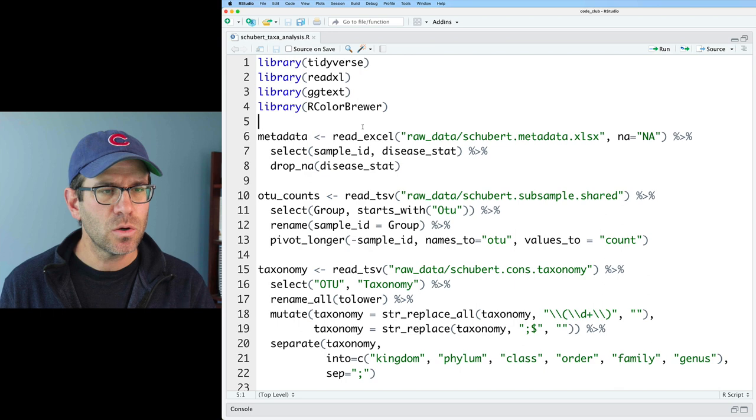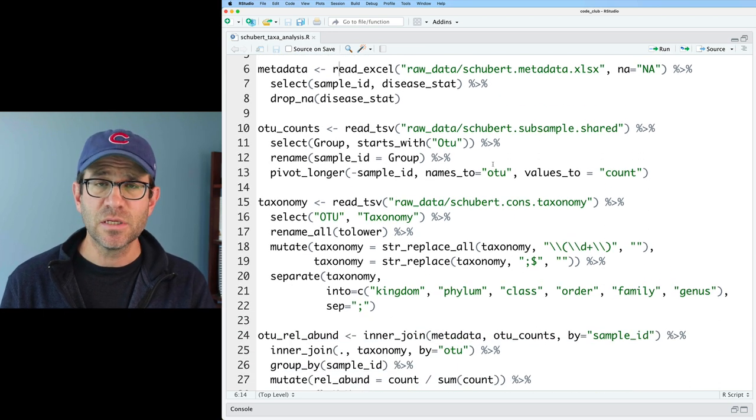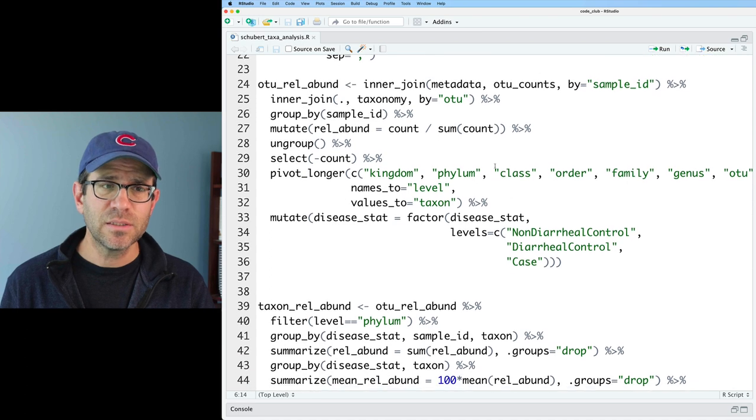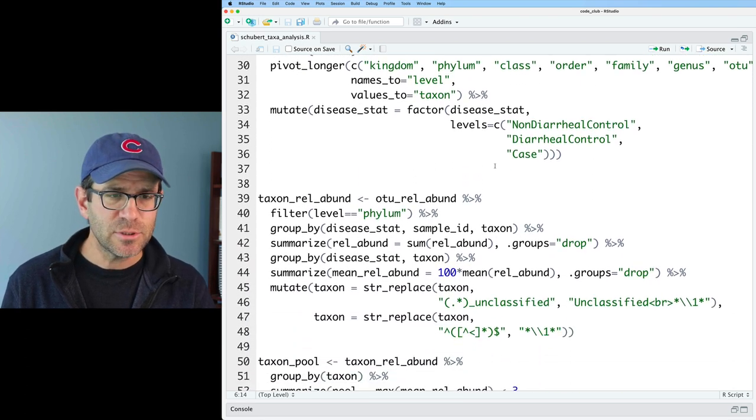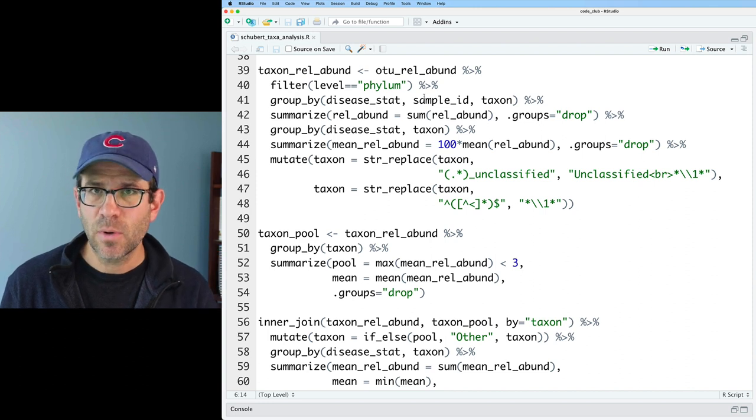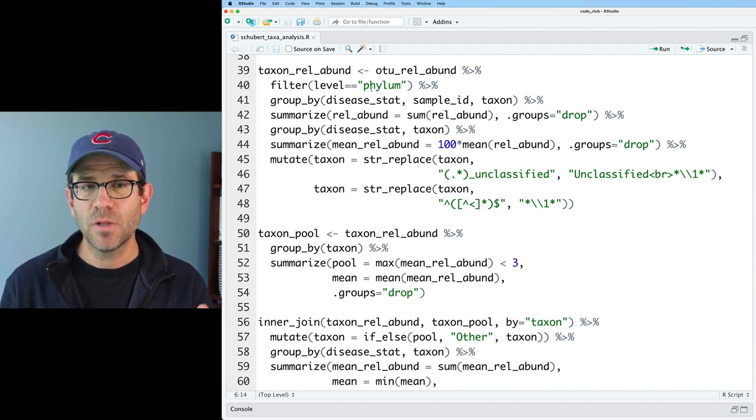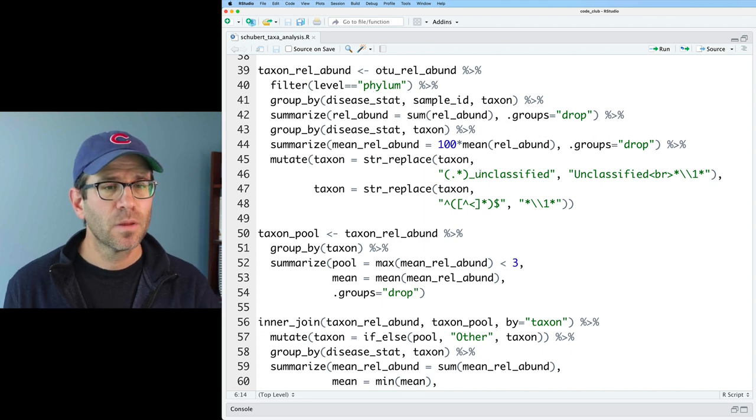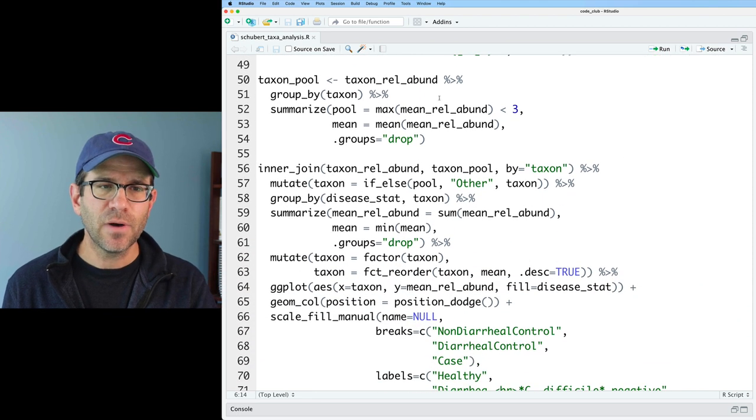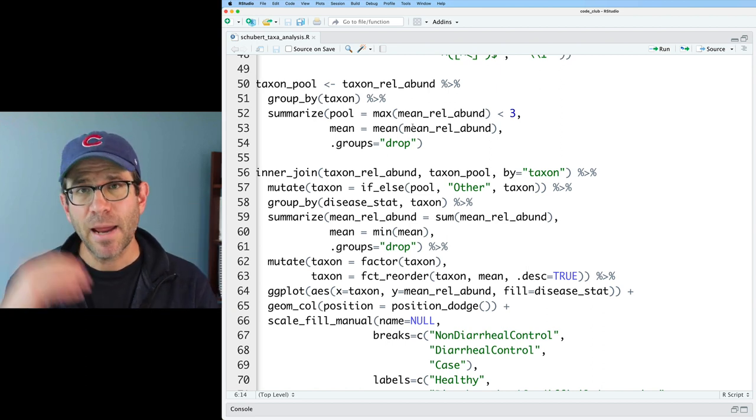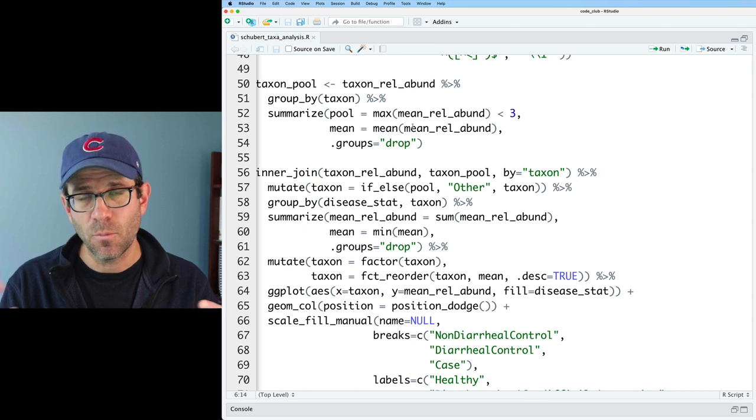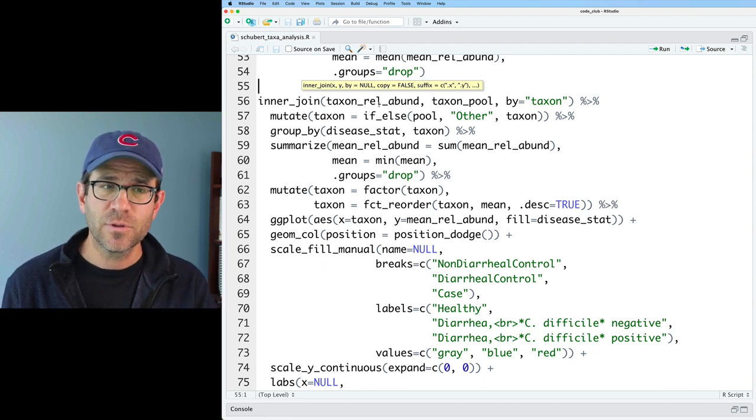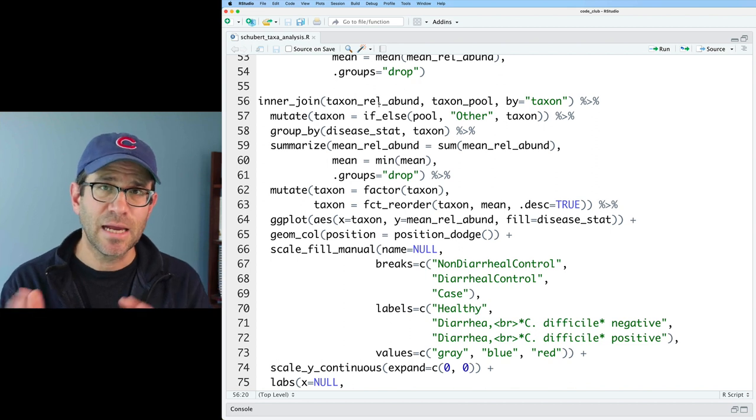So today, we're working through this code. We go ahead and we read in the metadata that tells us the disease status, the OTU data that counts for each OTU, the taxonomy information. We then join this all together and get the relative abundance for each OTU for each subject. We then look at taxon-rela bond as a data frame we're generating, where we're filtering at the phylum level. We're then aggregating together all those OTUs from each subject that belong to each phyla. We get the relative abundance. And then we identify those taxa, those phyla that we can pool, because their maximum abundance on average across all subjects from one disease status group is less than 3%. We then pool those phyla together by joining that taxon pool data frame with our taxon-rela bond data frame. And then we throw it all together to make a side-by-side bar chart.